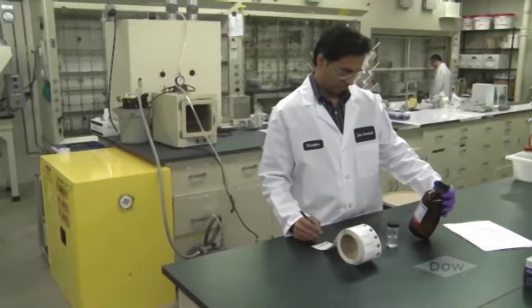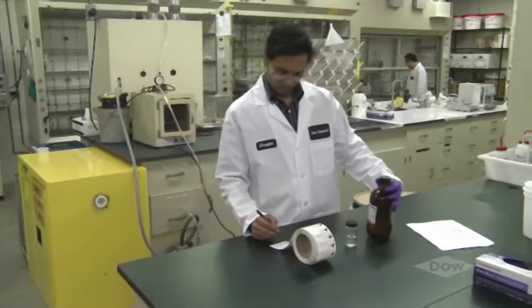Have you ever seen bottles in the lab and wondered, what is that? Who left it? Can I touch it? Do I need to wear any protective clothing? Or what happens if it spills? These are all excellent questions. And proper chemical labeling should answer those questions and more. To learn more about chemical labeling, let's follow NJ as he labels his sample he needs for his lab work.